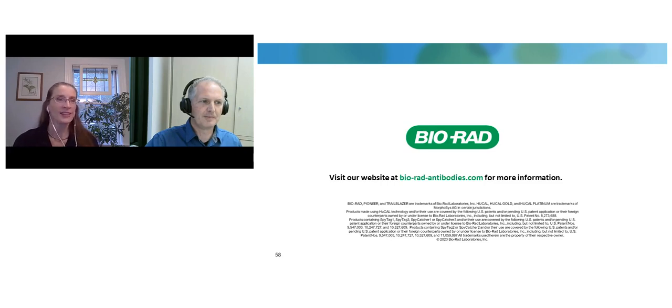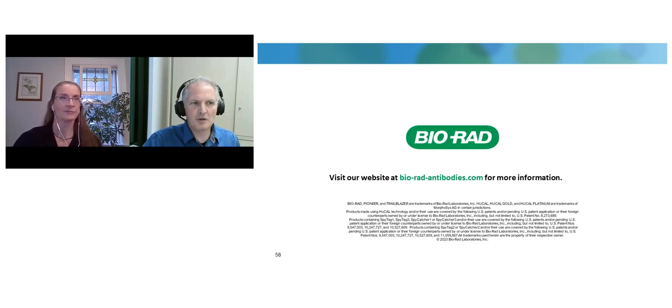And our last question is on the topic of the bispecific antibodies that you discussed. Can the bispecifics made with SpyLock be used as drugs? The SpyCatcher is a bacterial protein from Streptococcus pyogenes. So you basically don't want to give a bacterial protein into humans. It is done actually for vaccines, but there you want to get an immune response for your drug. You don't want to get it here. So it's not really meant as a bispecific drug.